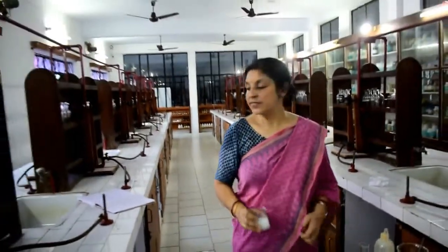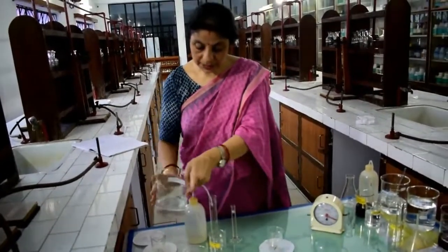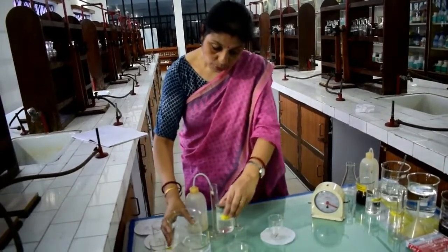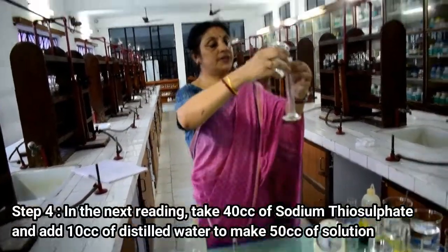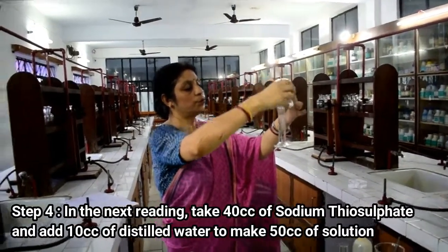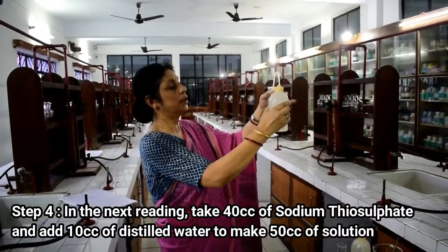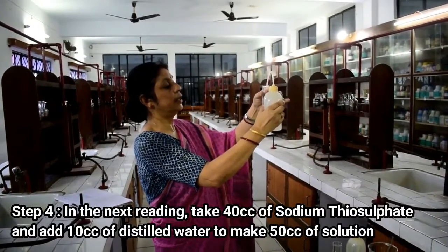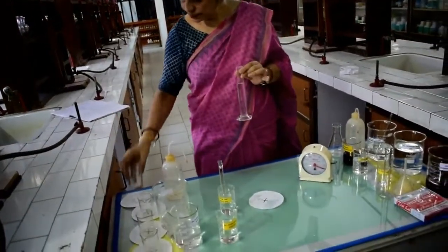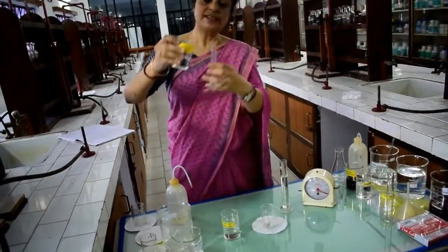This way, the next experiment which I am going to carry out, I take 40 cc of sodium thiosulfate and 10 cc of water. So this time I take 40 cc of sodium thiosulfate and make the volume up to 50 cc. To make the volume up to 50 cc, I am taking 10 cc of distilled water. So here I am adding 10 cc of distilled water, and here it is 50 cc. And I have taken a new beaker. Okay. And in this I am keeping 10 cc of HCl also.